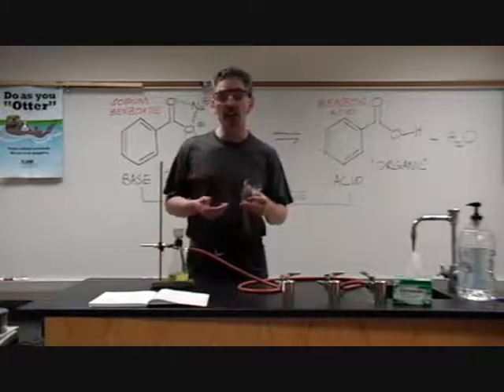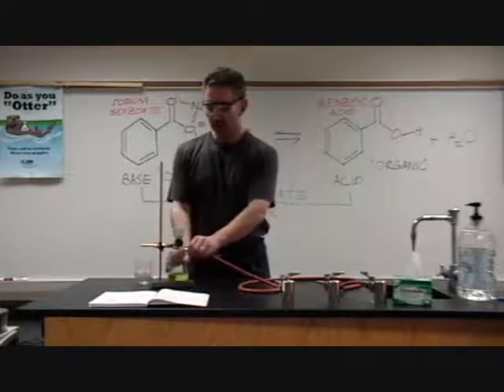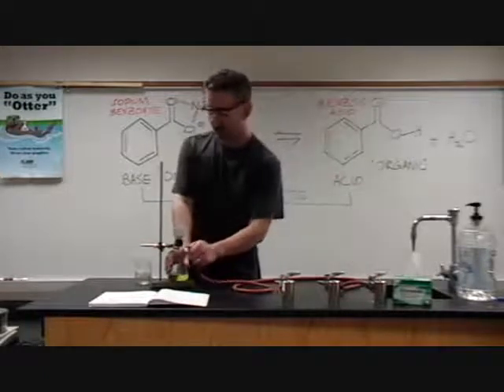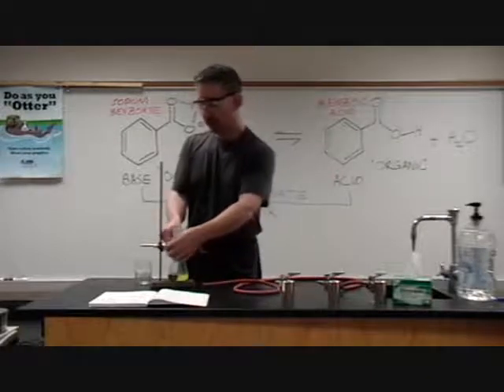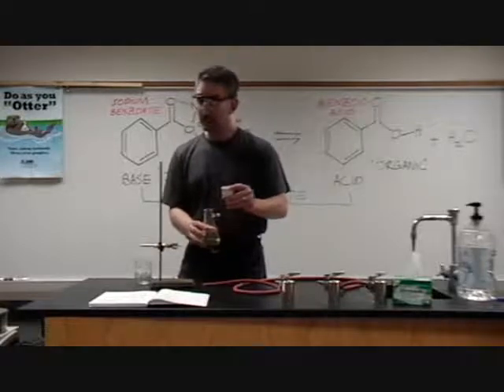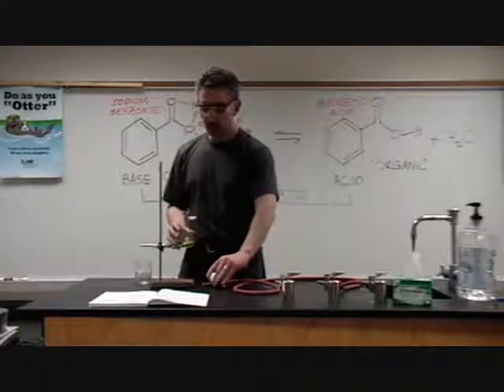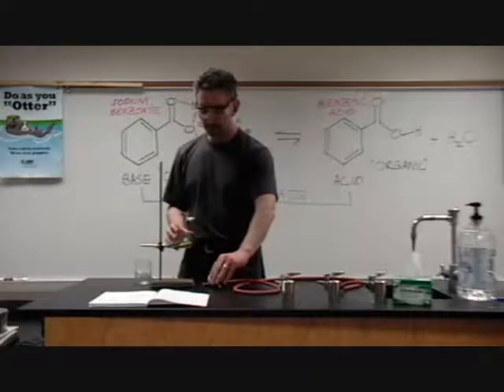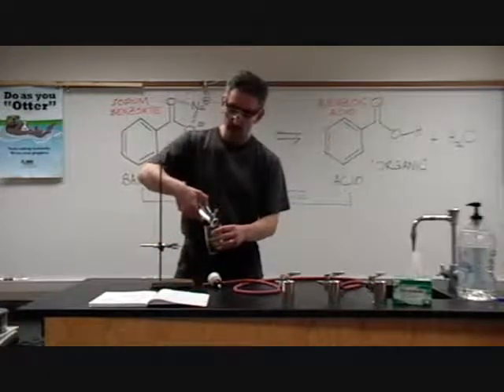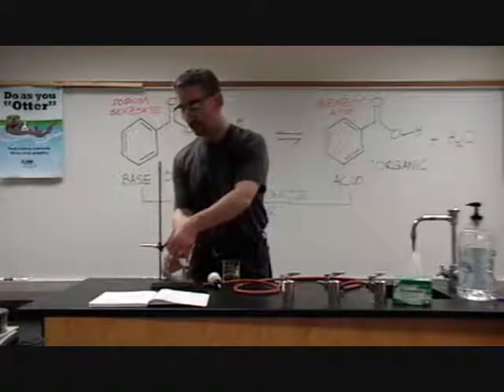Now if you find it difficult to scrape the last of the solid out of your beaker, you can always remove the vacuum, switch off the vacuum source first of course, take out your beaker, then carefully taking off the boot and the funnel, careful not to spill any of your collected solid, you can pour the liquid which is filtered through back into a separate beaker and reclamp your boot and the flask.